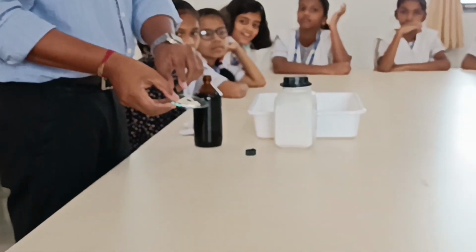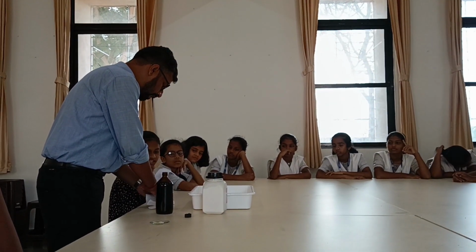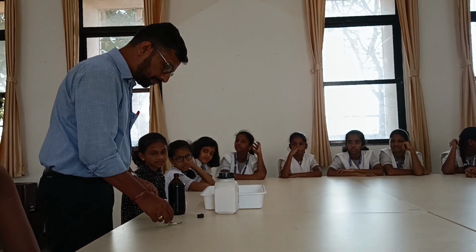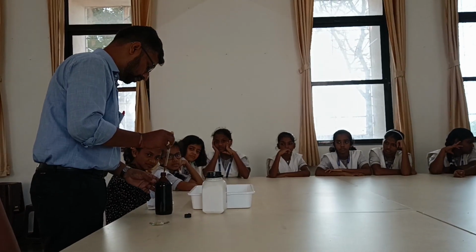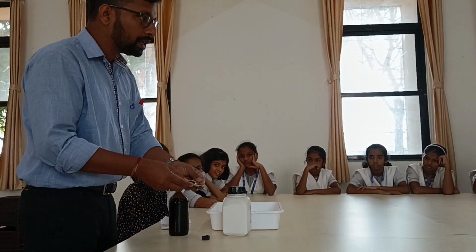Okay? So in the same way, if you take any food material, let us see what is here. Okay. So there is a roti. Let us check the roti also. Can you see? This also has changed into a bluish black color.